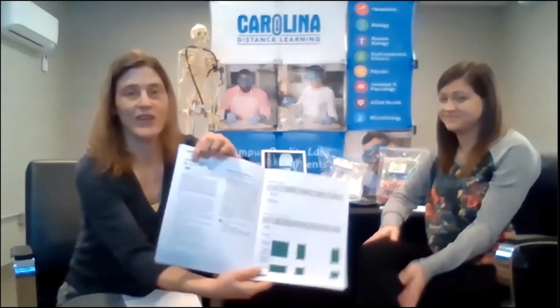Also in here, one of the important things to point out, the camera icons. I love these little icons. This is a place that shows a student, hey, stop what you're doing, take a picture of where you are in your lab right now. I like to get my students to take a selfie so I know that it was in fact them doing this lab. It's a way to reduce the amount of potential sharing of photos. So I have them put themselves in there, or I'll have them draw a picture of some random item that I chose that week. Like draw a picture of an apple.